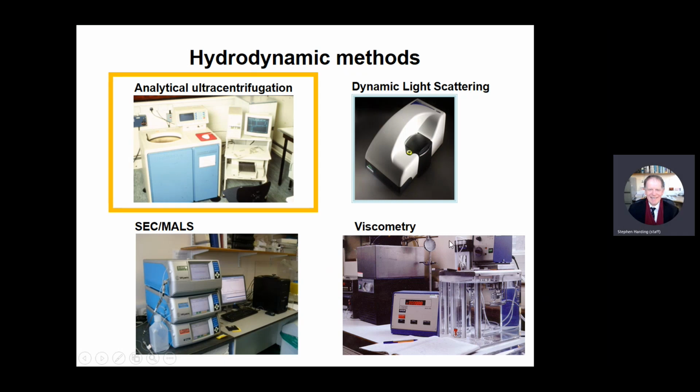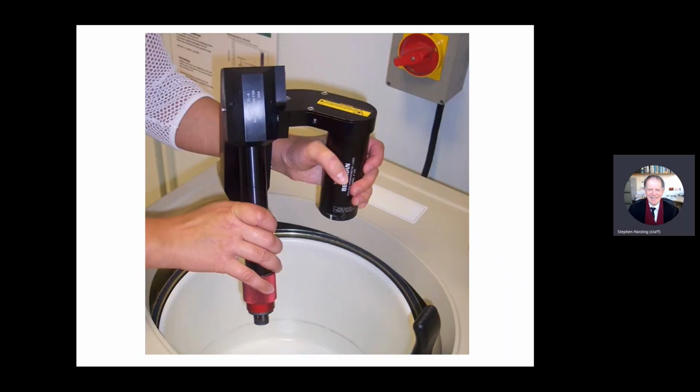Right, the final thing, the analytical ultracentrifuge, before we go across to the NCMH. I'm not going to go into any great detail here. We'll go into more detail when we do the antibody biotechnology module, because it's a gold standard method for looking at the purity, aggregation state, and conformation of antibodies. So we do that in some more detail when we do the antibody biotechnology module. So this is what the inside looks like. I think I showed you this.